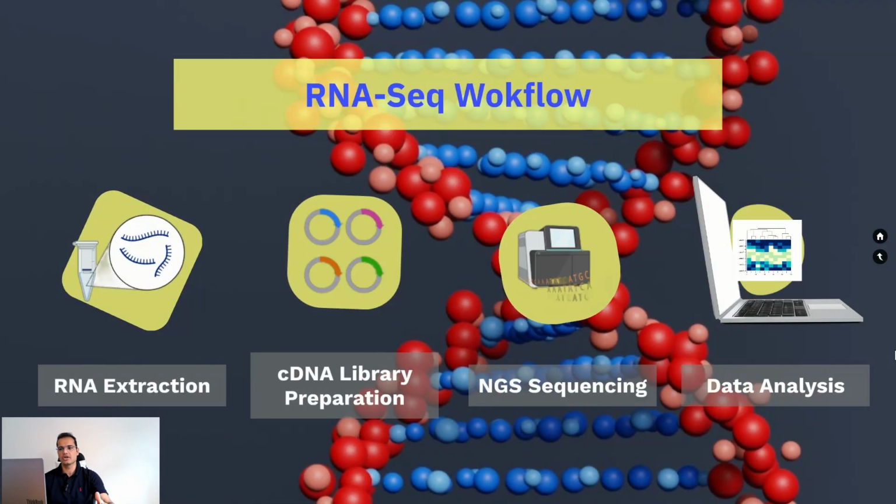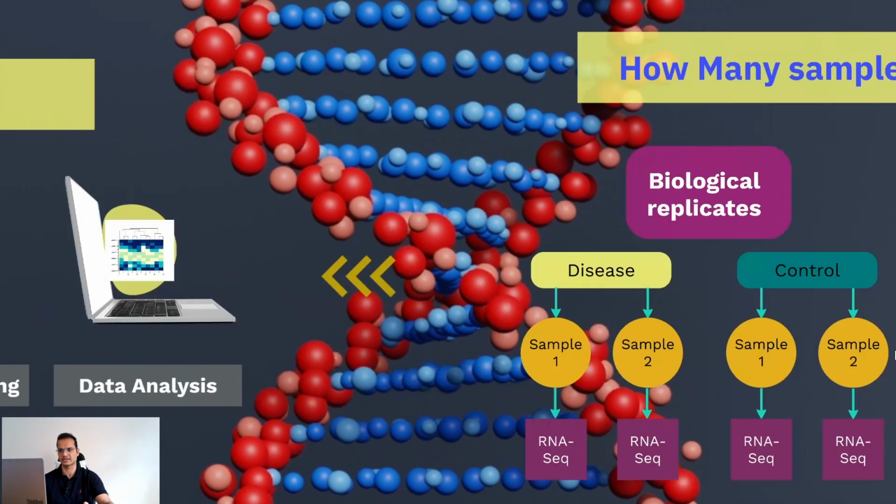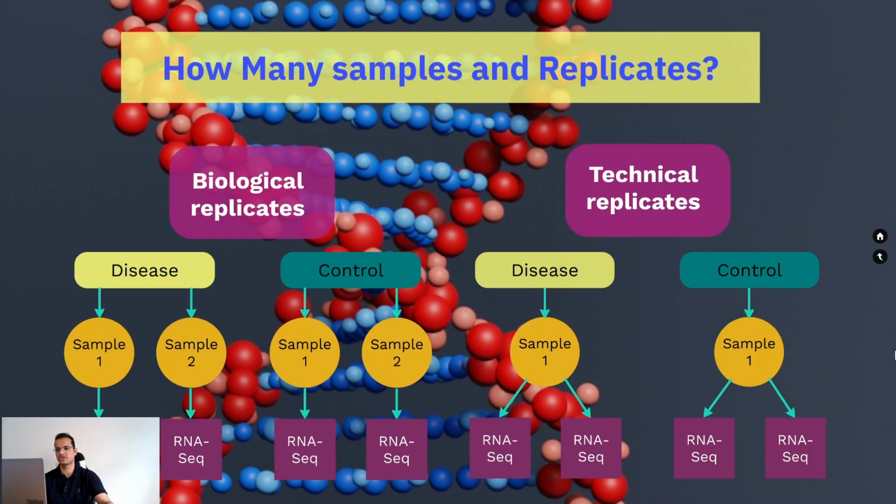Technical replicates are not as critical as biological replicates, but can help assess the technical reliability of the sequencing process. However, they are not a substitute for biological replicates.